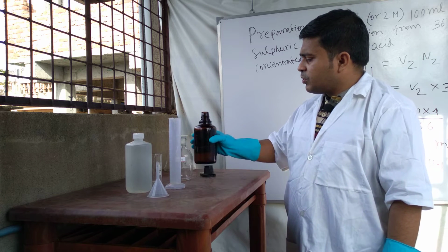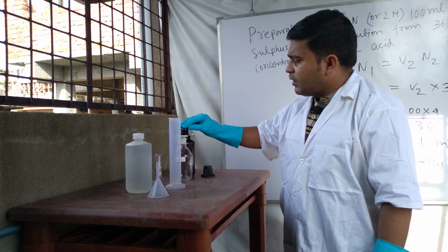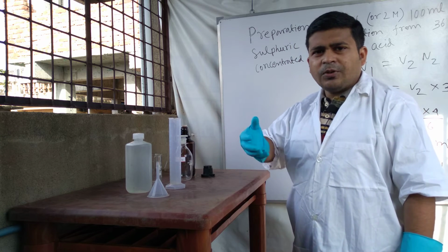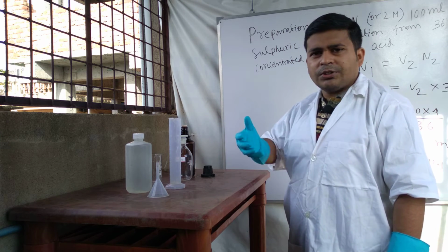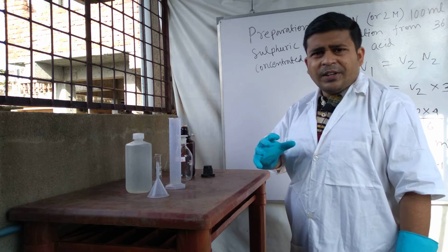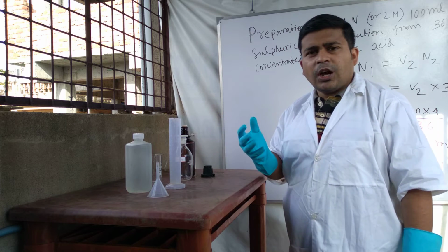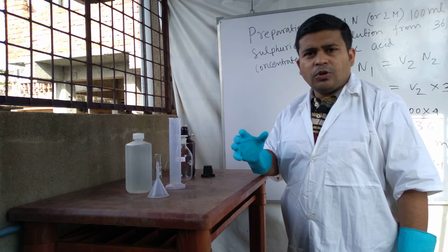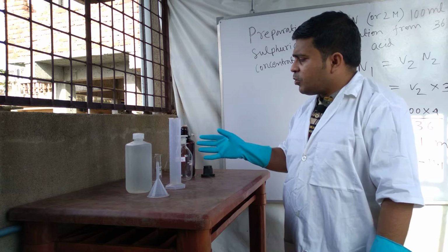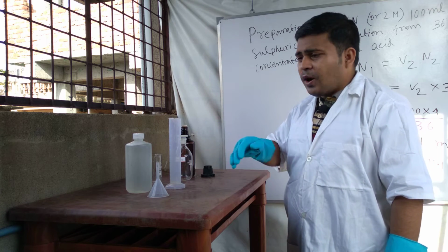So at first we do not take acid, okay, acid is given in water, acid is mixed in water, not water mixed in acid. So at first we have to take the desired volume of water, after that we add acid to the water, not water to the acid.